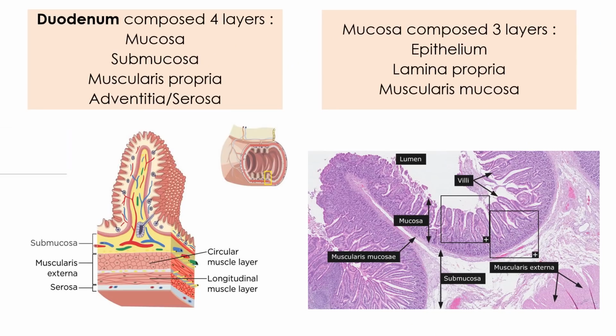Then we have the third slide, another slide. Any guess what this is? This is the duodenum. The duodenum is part of the small intestine, part of the gastrointestinal tract. I will briefly explain about it. So, the duodenum.